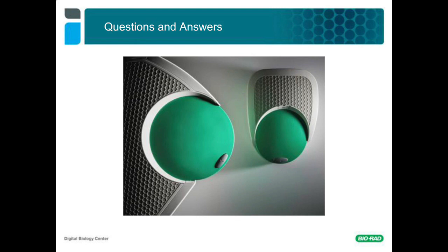Our next question is regarding sample prep. What is the best method to isolate DNA from cells for droplet digital PCR use? Does the DNA viscosity cause any issues with droplet formation?